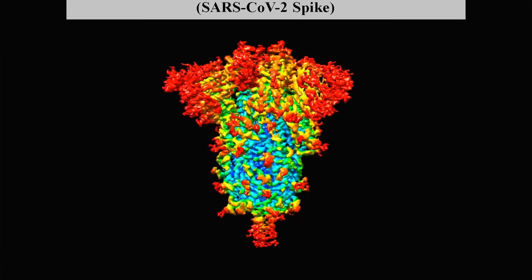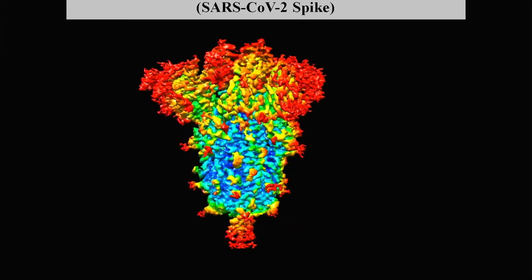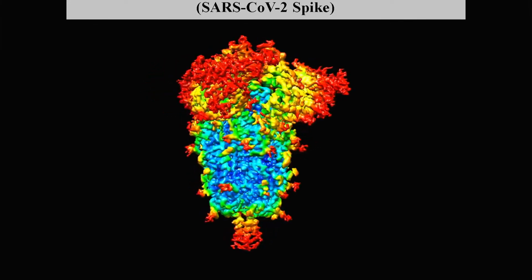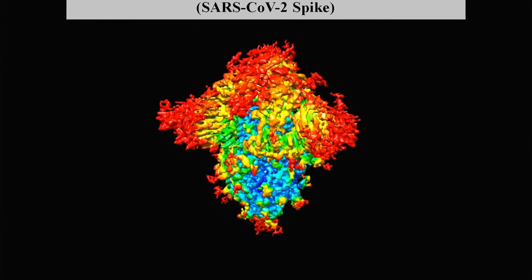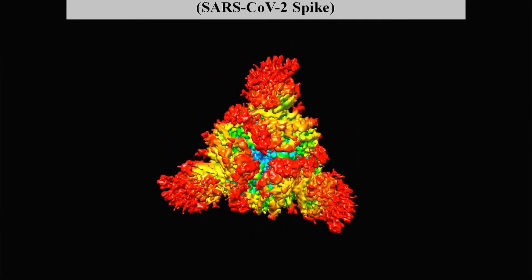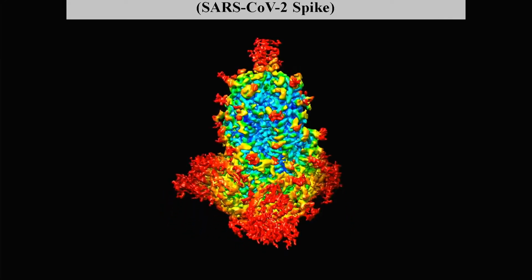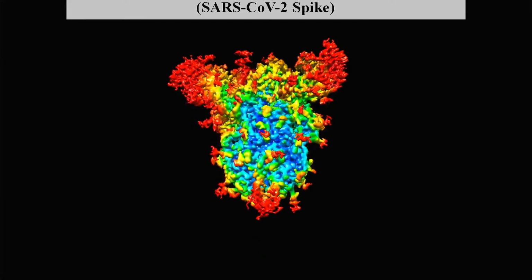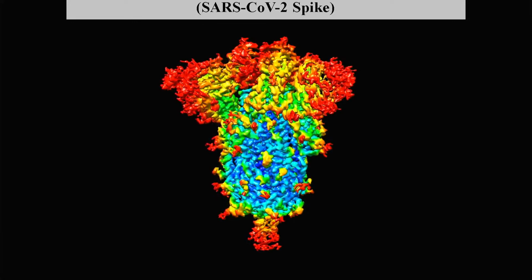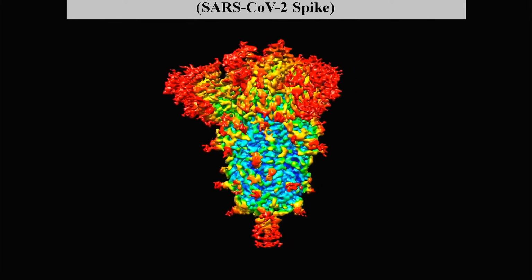You see here the spike protein, and I think the S2 part in here is the part that is most stable. You have the highest information density; the colors show that. And out here you have the lowest information density and most flexibility, with glycosylations that are floating in the air. Let me go to the next slide.